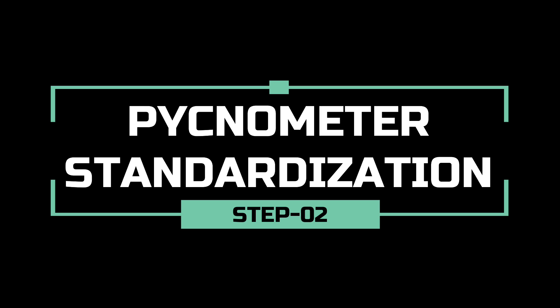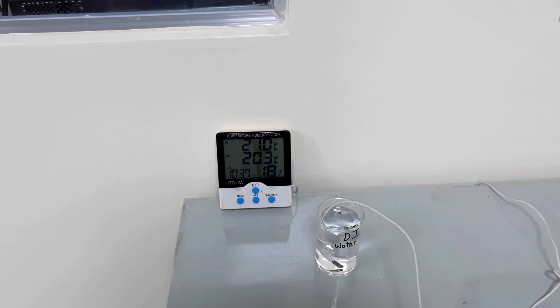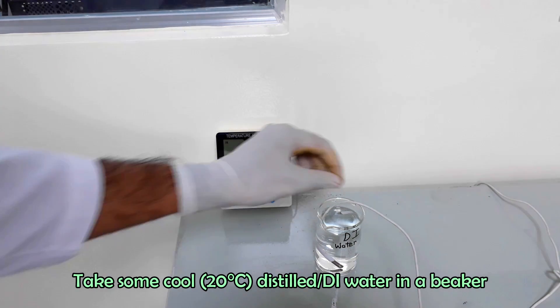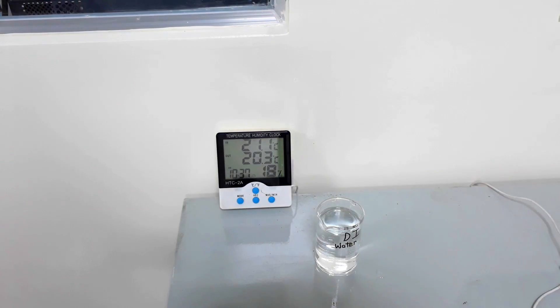In this step, we will standardize the pycnometer. Cool some deionized water at 20 degrees Celsius, then heat the water on a hot plate for boiling.